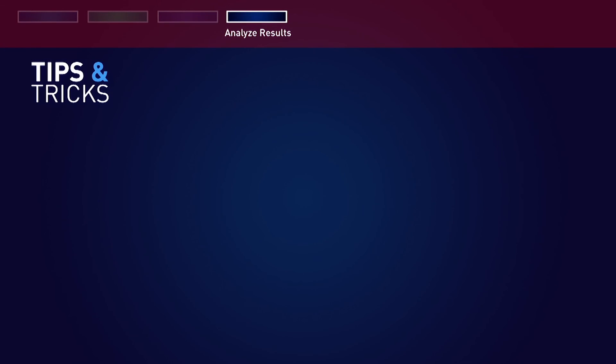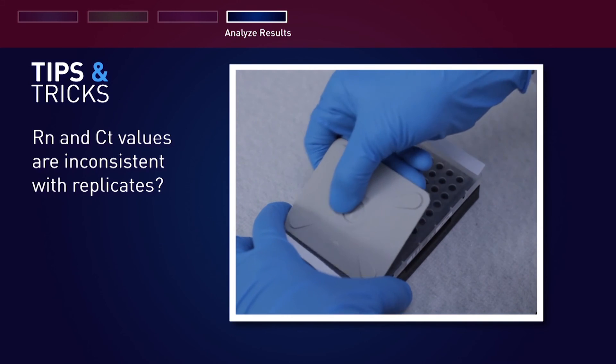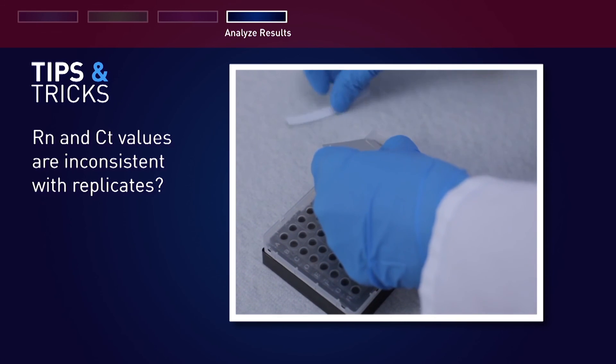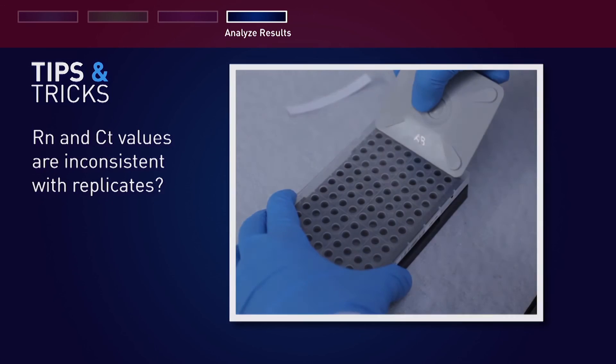If you find that the Rn and Ct values are inconsistent with replicates, it may be there has been evaporation of reaction mixture from some of the wells because the optical adhesive cover was not correctly sealed to the reaction plate.